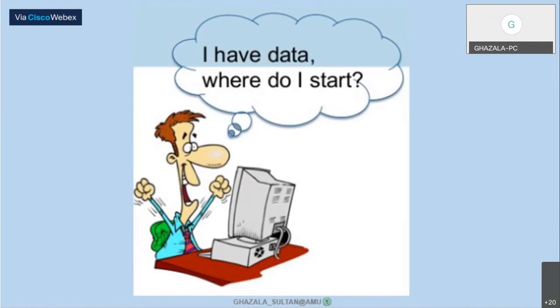Whatever I promised. Once we have the data, because of sequencing, we understand the basic theoretical aspect of how the sequencing has been done. That is based on which sequencer we are using, from NGS based sequencers. Once we are getting the data, what can we do with it, because sequencing has been done from the tool. In the last session of NGS also, we saw how the sequencing was done. I think we attended the last session as well, right? If you have any query on how the sequencing exactly has been done, we can have one session on that. You can tell me later.